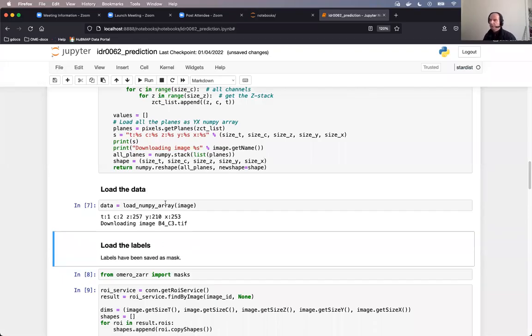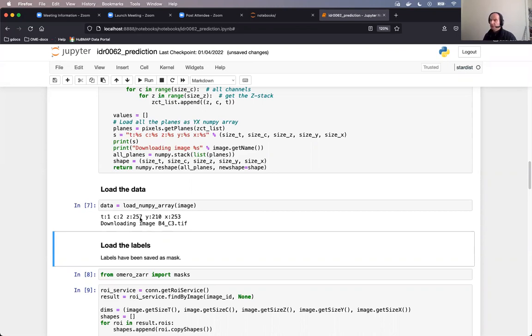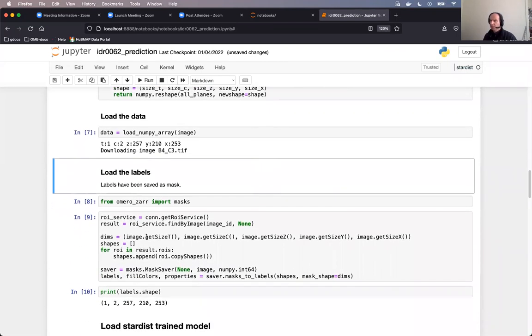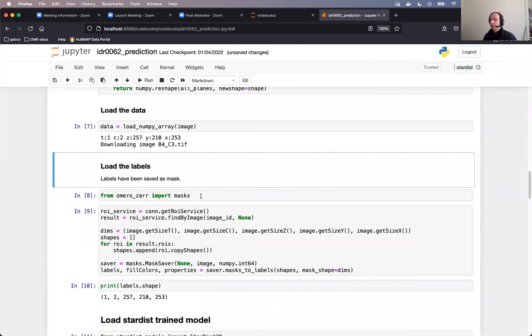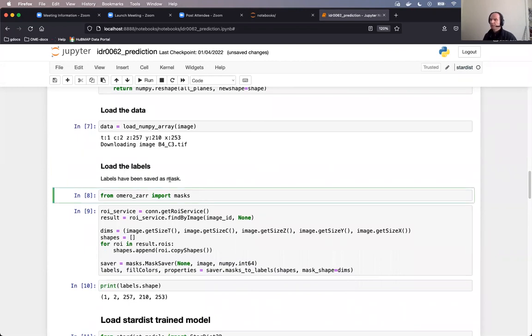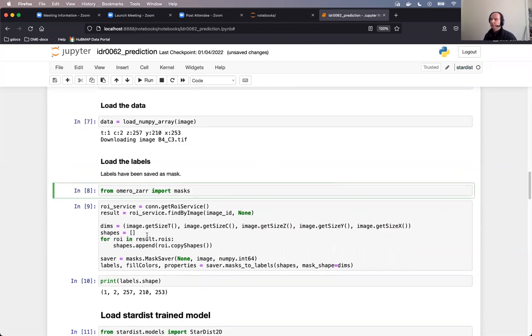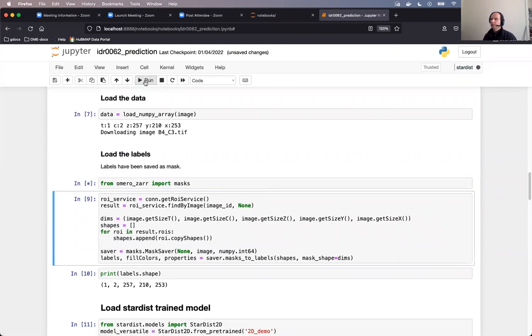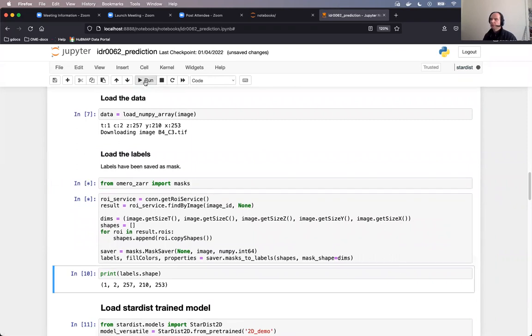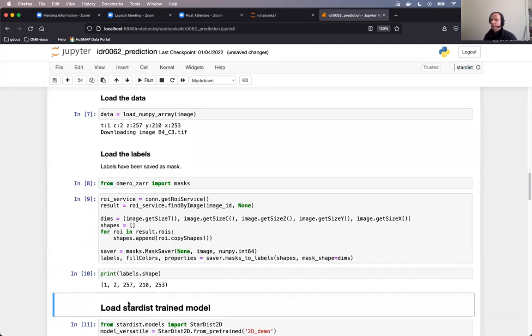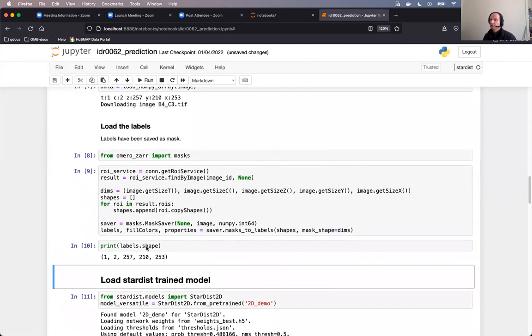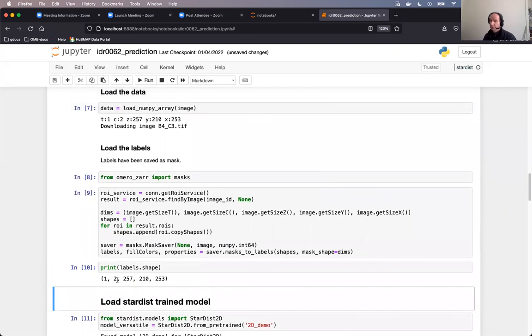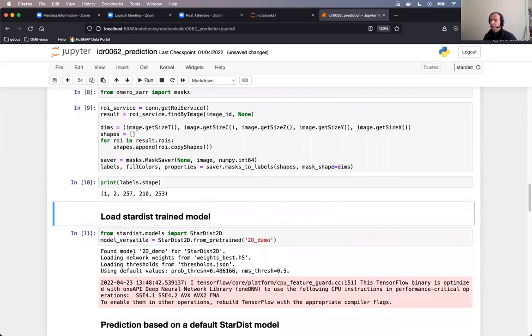So the binary data of the image has just been loaded. It is a single time point, two channels, and 257 Z planes. Now we will load the labels, meaning the segmentation results from the IDR from the authors of the paper. We will just load them and put them on the ice. We don't need them for our own segmentation. We will come back to that later. So I executed those two cells, which are basically using the Omero API to fetch the labels. And the labels are also in three dimensions. And of course the dimensions correspond to the dimensions of the image.